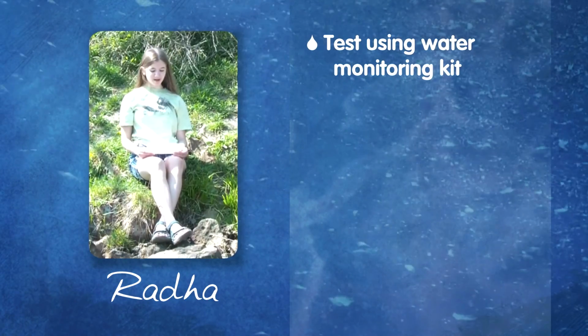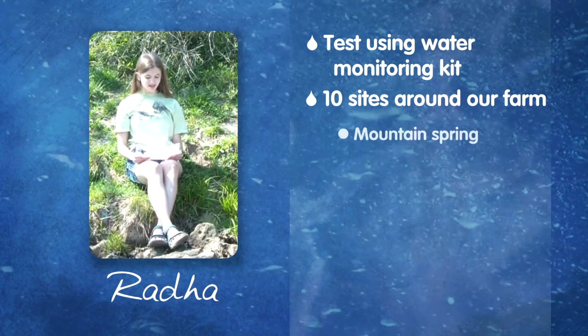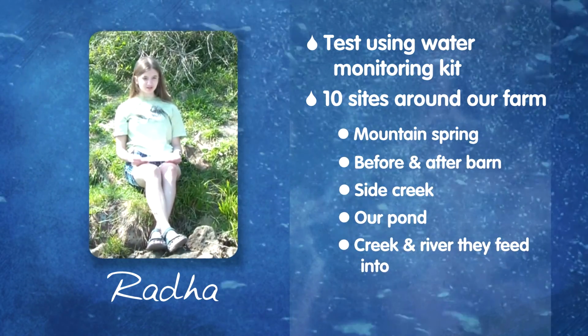We will be using a water monitoring kit that comes with 8 basic water quality tests. We selected 10 sites based around the 2 creeks that run through our small farm and the creek and river they feed into.